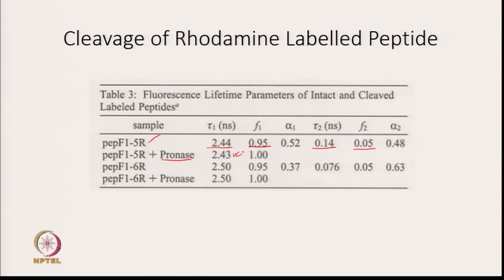Now, when you clip this with this enzyme pronase, what you are going to get is only one conformation. You see, it can be fitted only by single exponential, and all the fluorophore is now decaying with the 2.43 nanosecond lifetime, which is quite close to this one.